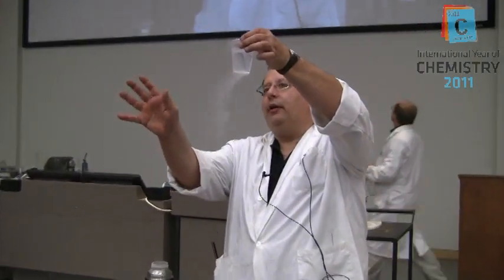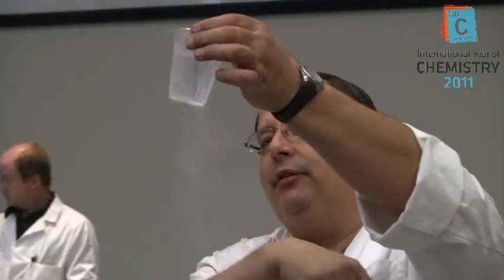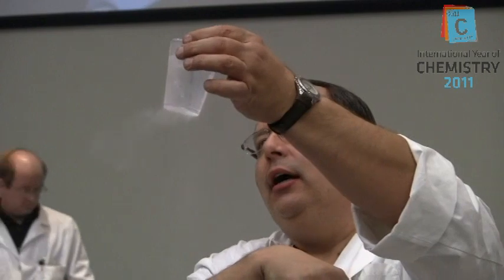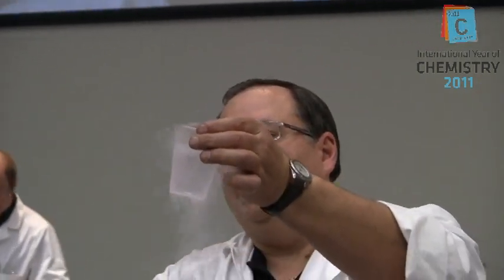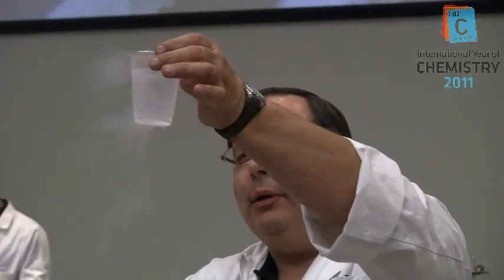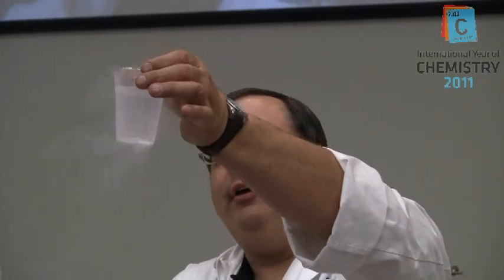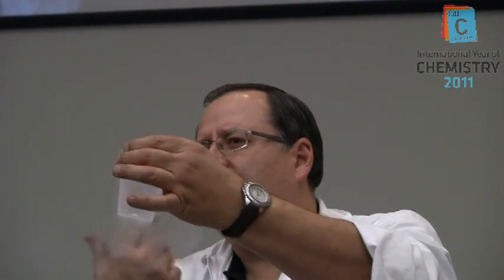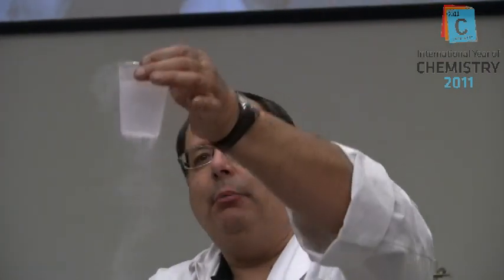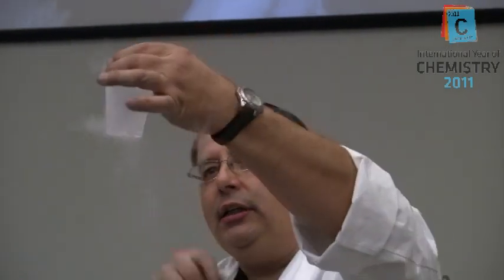What's happening is water that is around us is actually forming little mists or clouds. And if the water actually touches the cup, we're actually getting snow and ice forming. It really isn't bubbling that much. I mean, it should be boiling vigorously like soup on a stove. However, because this cup is very smooth, you don't get much bubbling occurring in here. I don't know if you can see it, it's just a little.